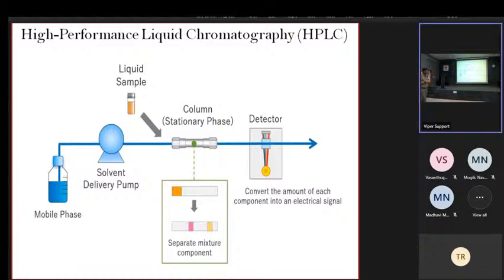Okay, so this is the basic structure diagram of the HPLC. The major thing is the mobile phase. Mobile phase means one reservoir. If it is a gradient elution, there is more than one reservoir, more than one container, 1, 2, 3 or maximum 4, a quaternary system. And then there is the pump. Because we are using a mobile phase, we need some device to pump the mobile phase through the entire system.